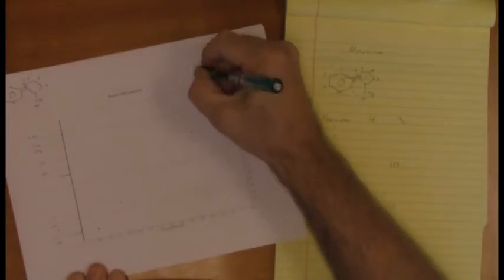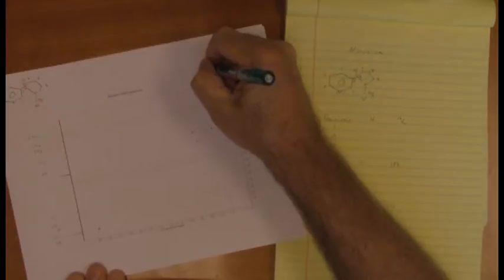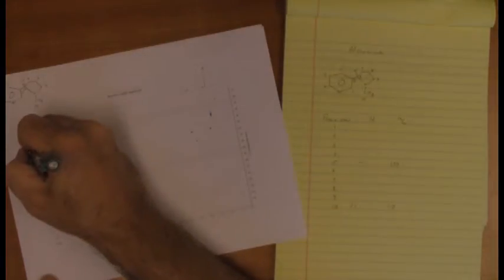And I'll point out that when we do these things on the HSQC, we don't really need it for this, but this is a good teaching moment. I know that is position 10, so I mark that.